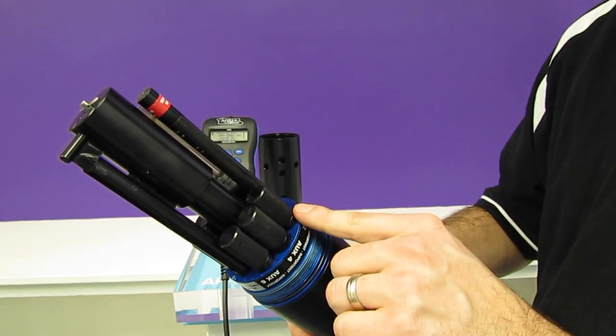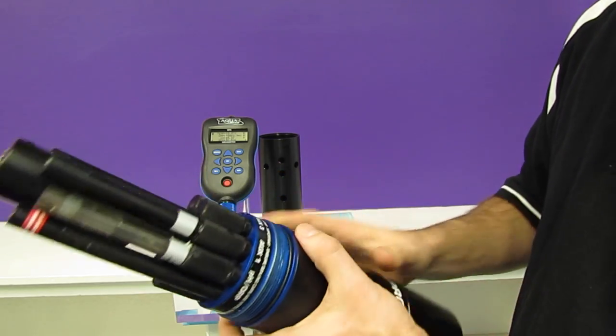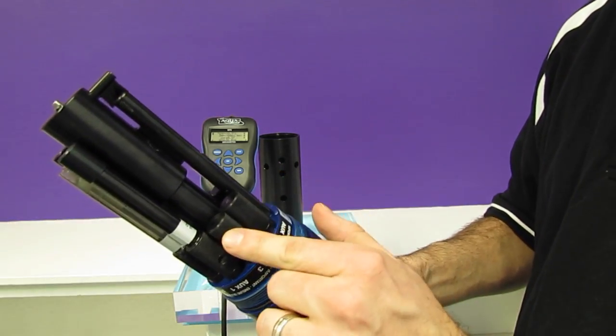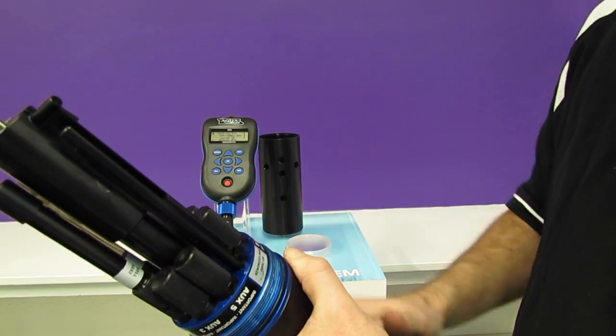We also have six auxiliary sensor ports on the AP7000, three of them found here and three of them found on this side. We also have the home position where the depth sensor is located at the bottom.